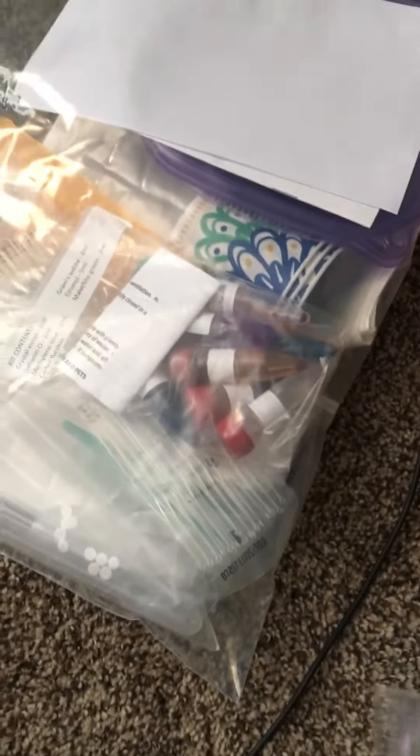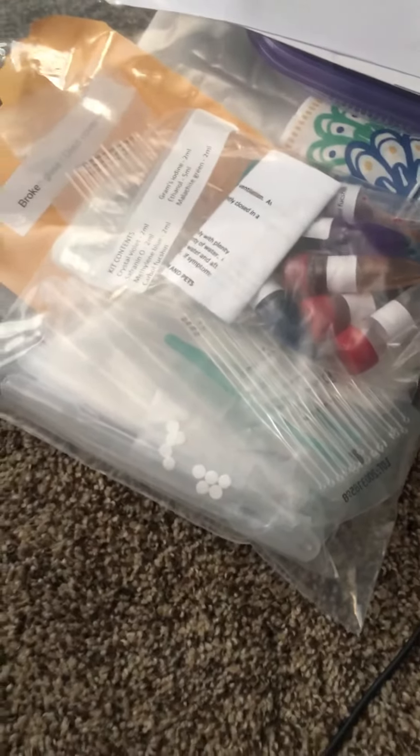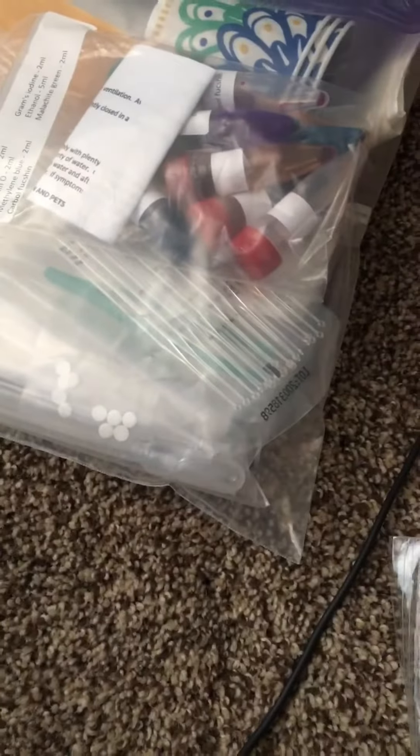This is the kit that you're going to get — it's a plastic bag with a bunch of materials in it. You might want to leave everything in that bag until we can go through it as a group. Inside that bag you're going to see there are some agar plates that look like this. They're in ziploc bags, and you are going to want to be very careful with them because we don't want them to open.